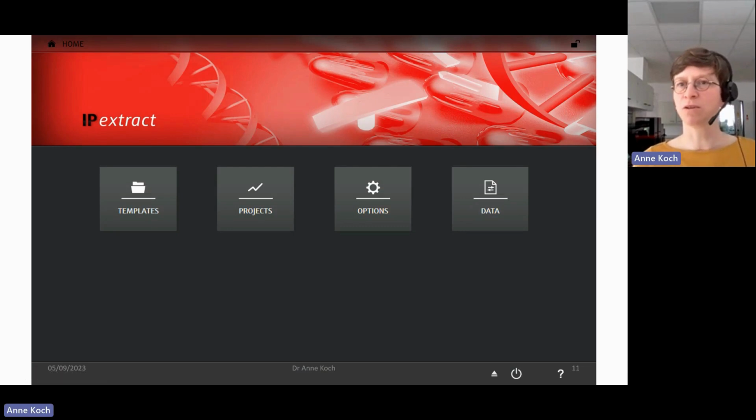And then basically the tray is prepared and you can input it into the device. You will start it, and this would be the home screen. And here you can see the surface. I mentioned it before. We only have those 4 buttons, one for the data management. Here you can find all the log files, also the templates and project files are saved here. In the tools section or in the options section, you can find some tools, but also information on the firmware and software, and also update possibilities. And of course, also how to contact us in case you have any questions.